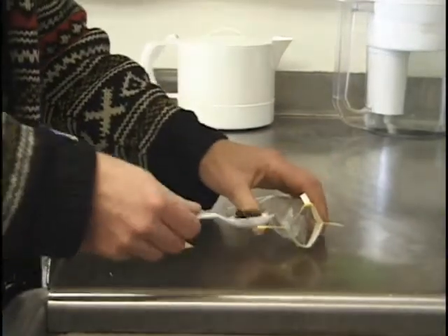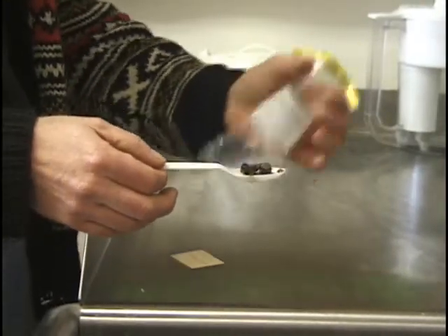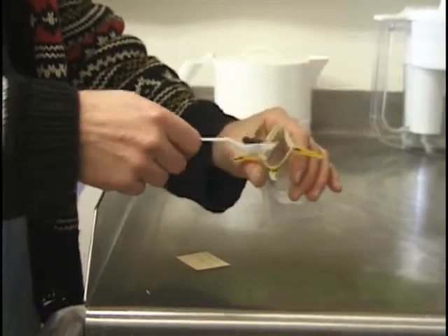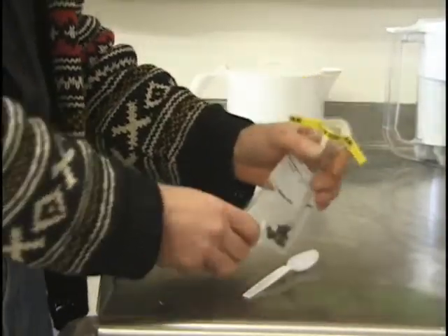We've collected our bees and we've got them on a spoon. What we're going to do is add them to a whirlpack so we can store them until we have time to process them. We just drop the bees in, flick them off, and then we add a site label.